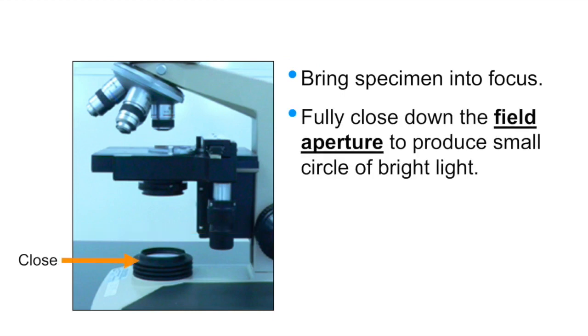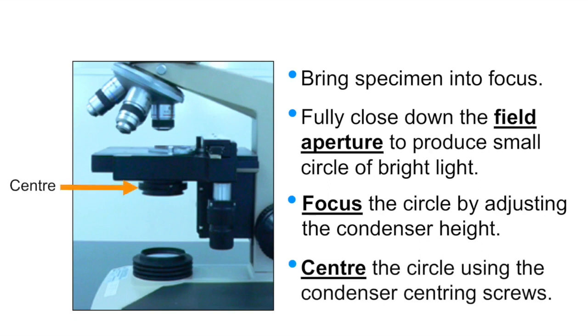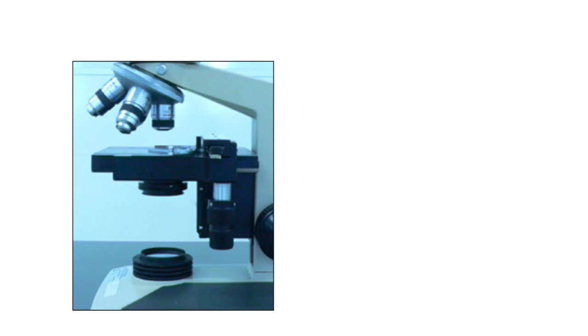We then fully close down the field aperture, if able to do so, to produce a small circle of bright light. We then focus the edges of that circle by adjusting the condenser height adjustment knob, in this case hidden from view on the left-hand side. We then center the circle of light using the condenser centering screws, if present, before finally reopening the field aperture diaphragm until it's just outside of the field of view.